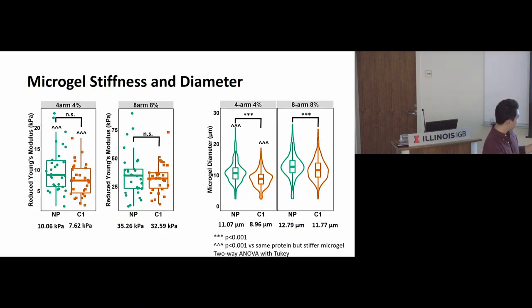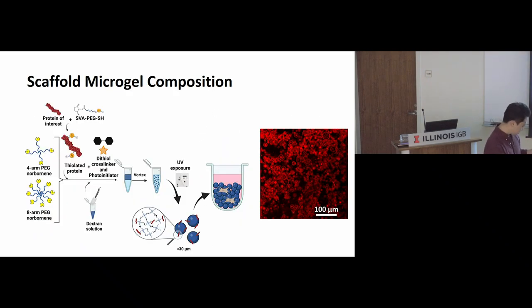So when I perform this reaction, I use up most of the leftovers, but there are people that don't. And then those leftover norbornenes, they can crosslink the macromers with themselves.